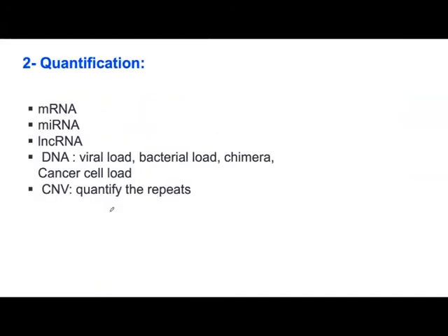Now, the other important topic that I want to discuss, and I'm trying to finish fast now, is how we're going to use RT-PCR for quantification. And I think most of the attendees would like to know this more than genotyping and detection, because we use RT-PCR mainly to quantify. There are different applications. For example, I want to see whether you have virus or not, but I also want to answer how much of the virus you have. So viral load, also bacterial load.